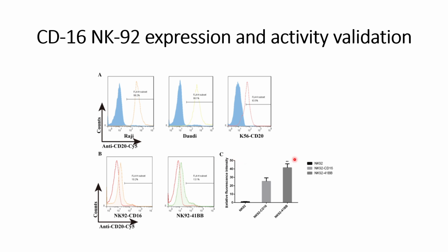We will discuss further activities in our subsequent videos. I hope you understood how they validate the CD16 and NK-92 expressions and their activity validations using Rituximab.